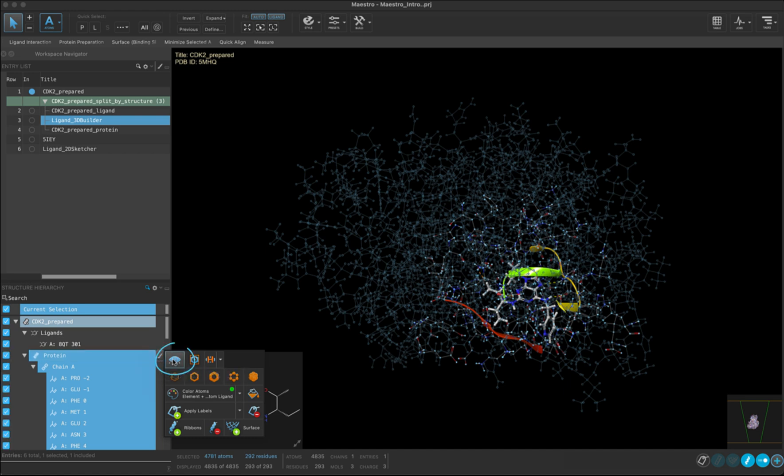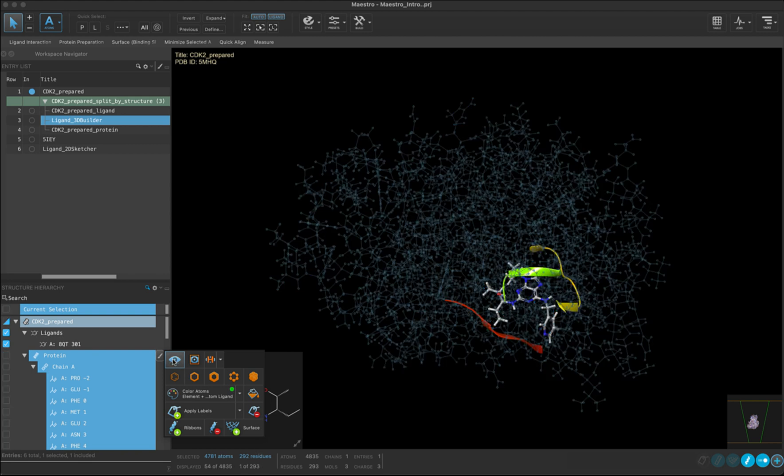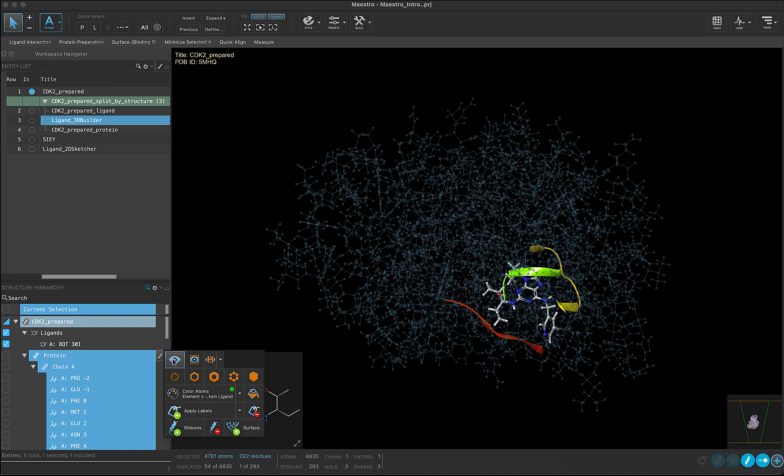If we click on the eyeball, then we can see all the atoms, including the hydrogens. If we unclick it, now none of the residues are in view. This is an important feature that allows us to control just how much detail we are able to see in the ligand binding site. It is important to structure-based drug discovery to try to strike a balance between having too many atoms displayed and not enough so that SAR can be built through the integration of as much atomic level detail as necessary.